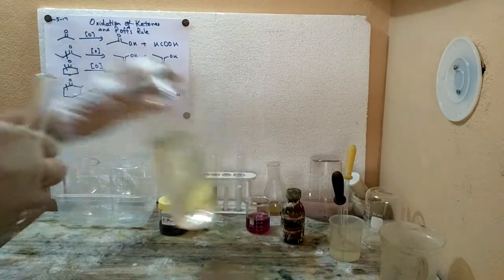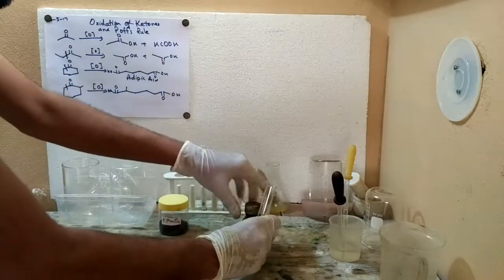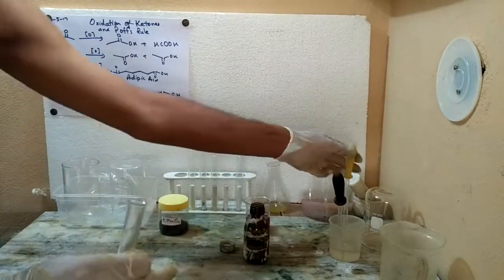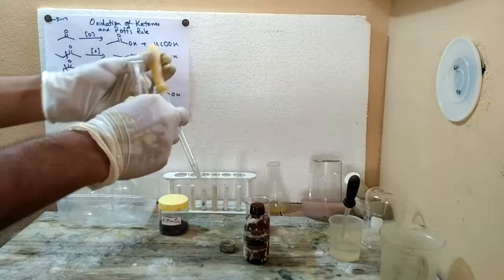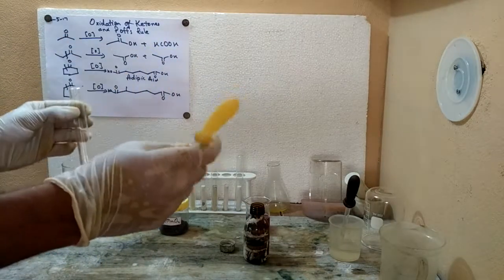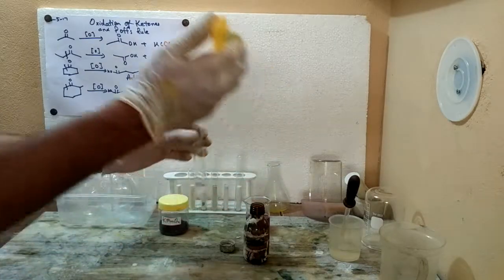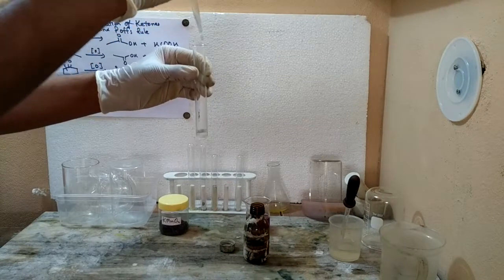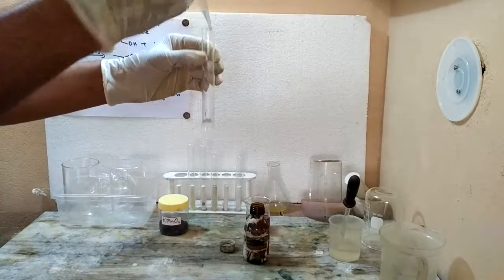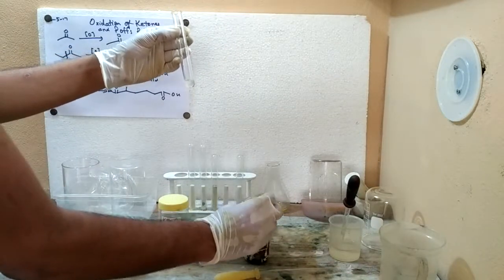And just to catalyze this reaction, add a few drops of concentrated sulfuric acid. The addition of sulfuric acid to water is very exothermic, and you can see that the solution just started to boil over a bit.